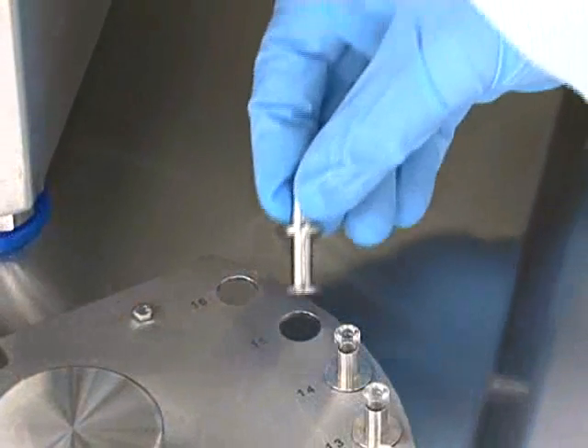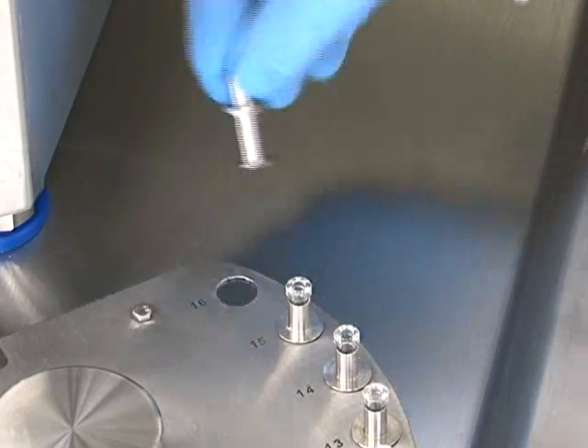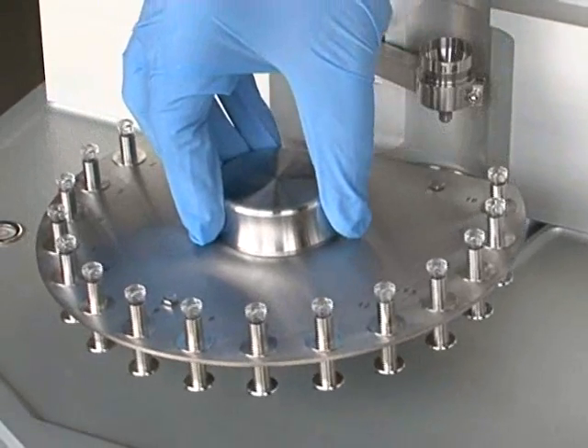This example shows glass vials which can be used to assist formulation work being added to a body bush and loaded onto the dial plate. The dial plate is then placed onto the system and the vials are filled.